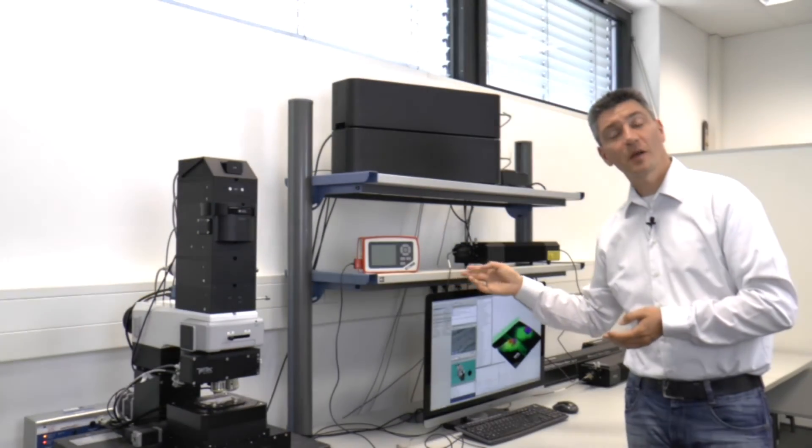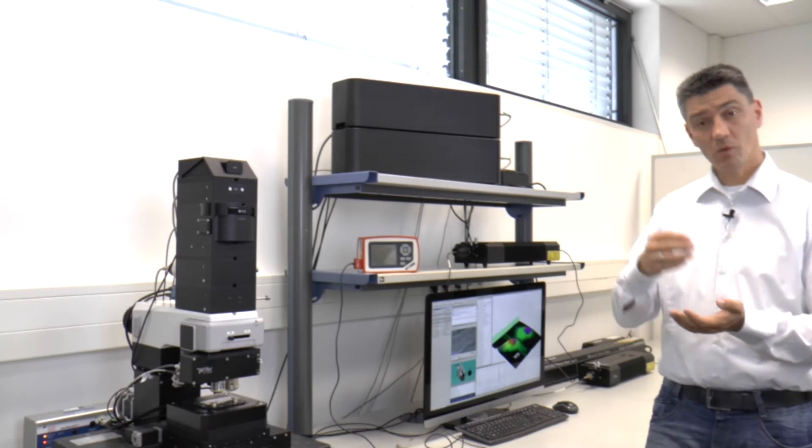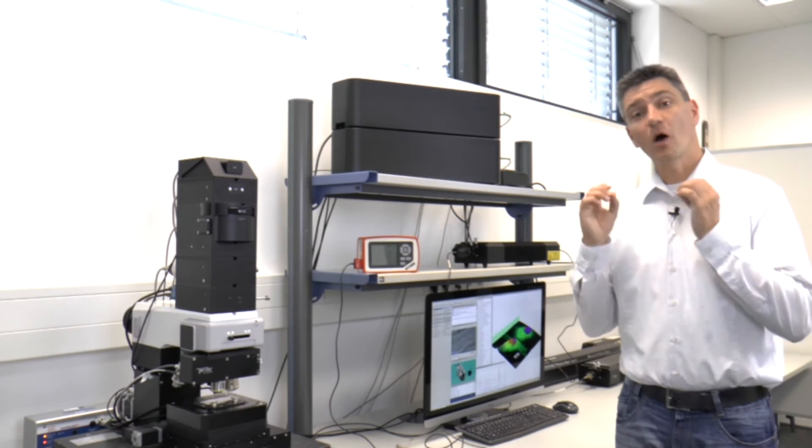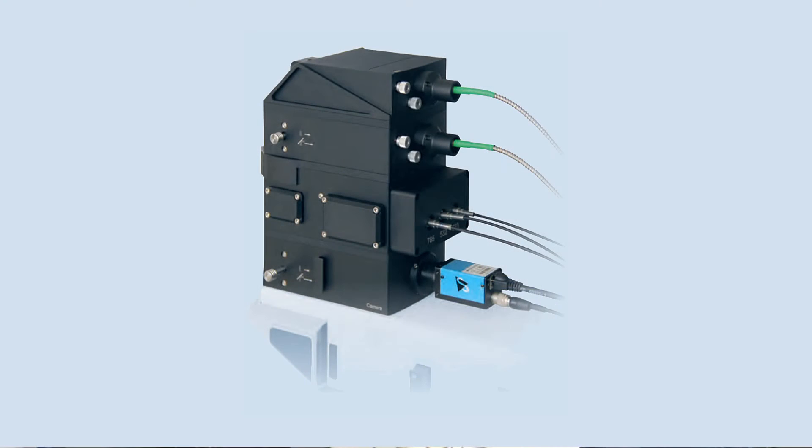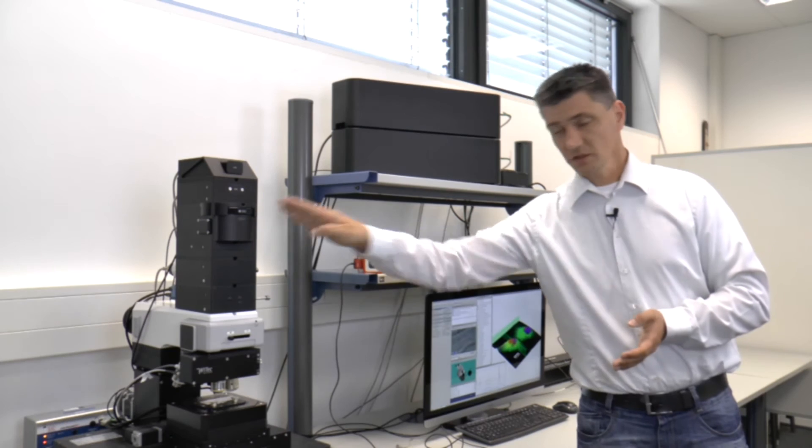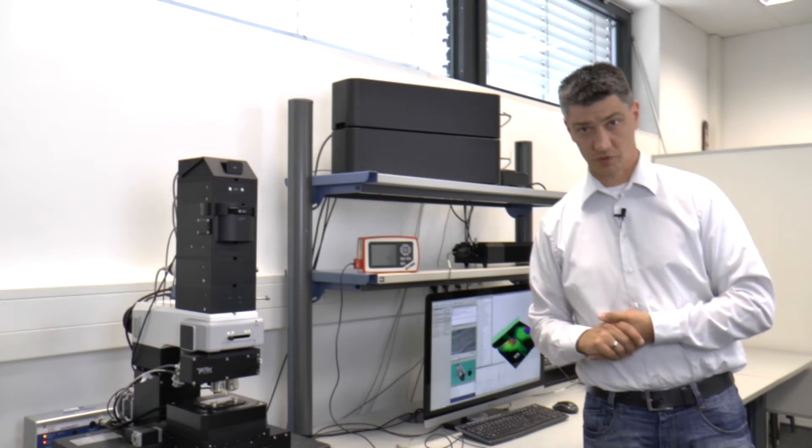The single mode optical fibers used no matter whether you use true power or the non-true power version are always polarization maintaining. That means you enter the microscope with a fixed polarization. In addition you've got a diffraction limited point light source at the output side of the fiber which means you enter the microscope with a diffraction limited point light source.